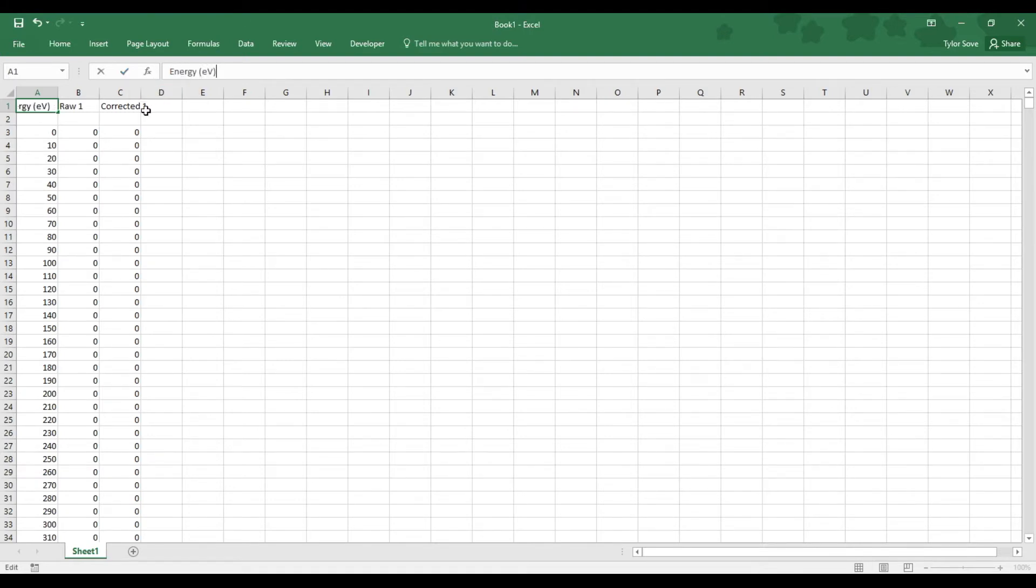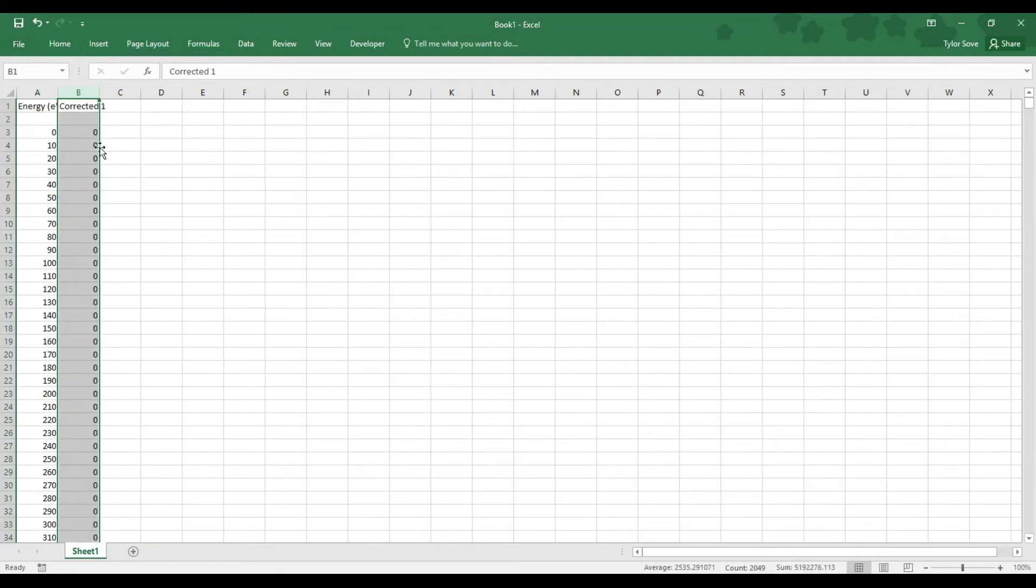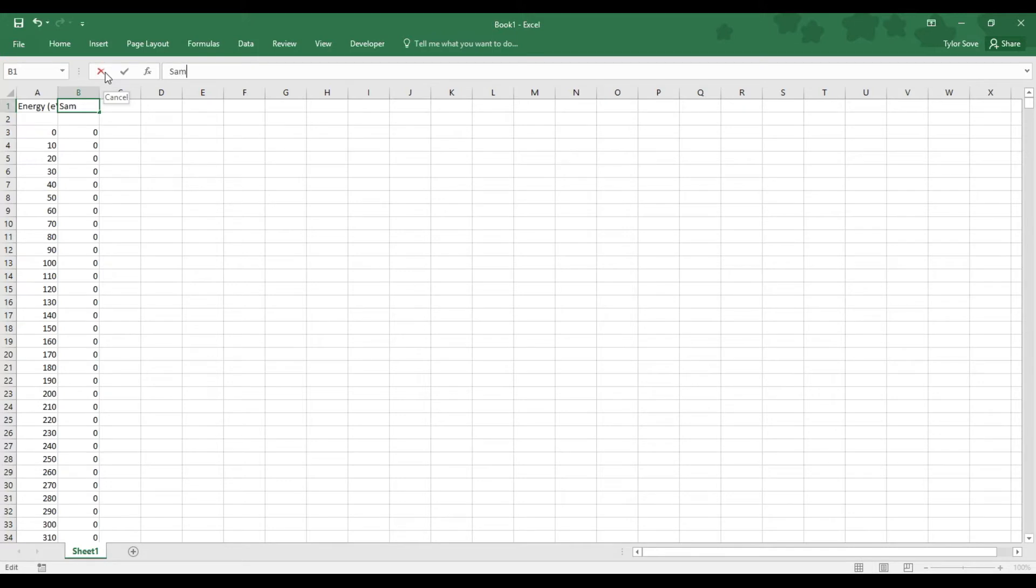This RAW1X can be deleted, as this is the raw data that has not been recalibrated for instrumentation effects. What is now column B is the corrected data that has been corrected for instrumentation effects. So we can relabel this to the sample name. Now we're ready to import the next sample set. We can minimize Excel, close the previous notepad, and open up the next one.